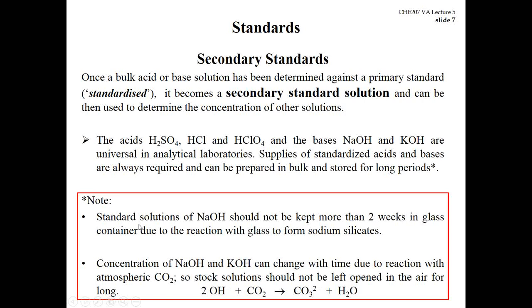It is important to note that standard solution of sodium hydroxide should not be kept for more than 2 weeks in a glass container because of the reaction with glass to form sodium silicate. So in general, standard solution of NaOH should not be kept in a glass container at all.